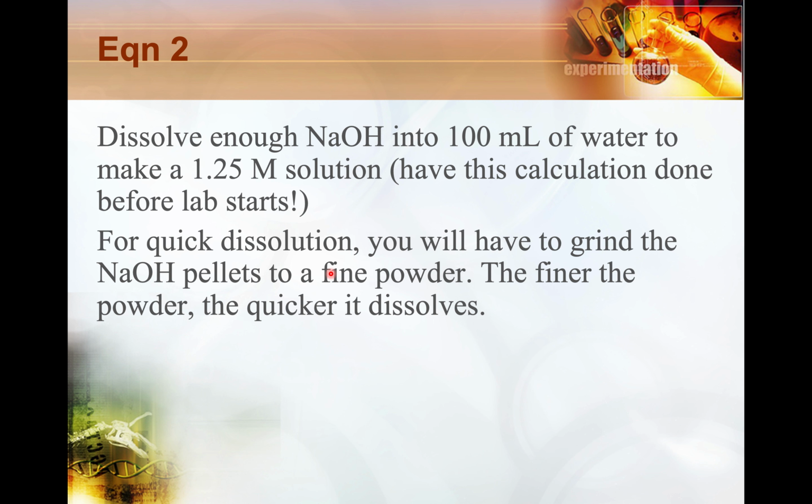We'll try to demonstrate it in the lab, but you grind slowly, carefully, and with force. You don't smash because you don't want sodium hydroxide pellets to be flying around.